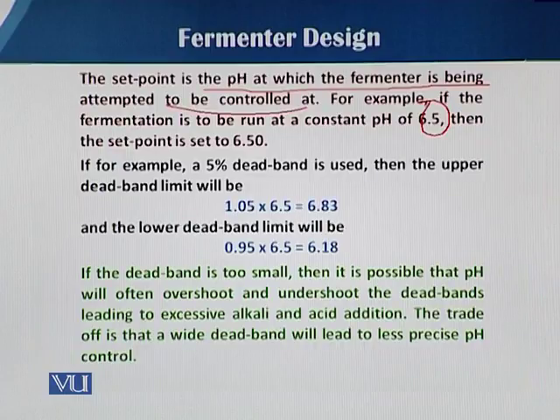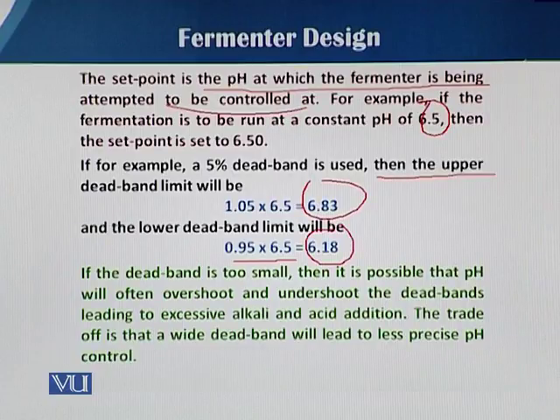By calculating that, for plus 5%, it is 105 divided by 100, meaning 1.05. Multiply by the set point, and the answer is 6.83. In the same way, for minus 5%, it is 95 over 100, meaning 0.95. When you multiply this 0.95 with 6.5, the answer is 6.18. So as far as the upper band and the lower band are concerned, pH 6.83 will be the upper band and 6.18 will be the lower band.